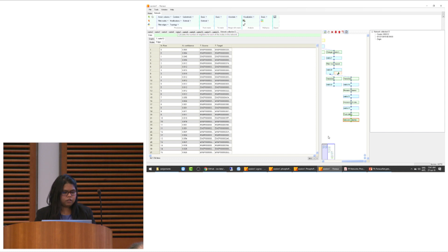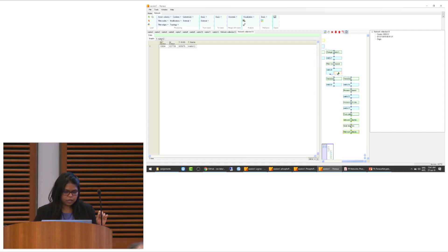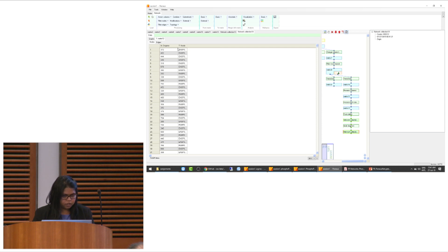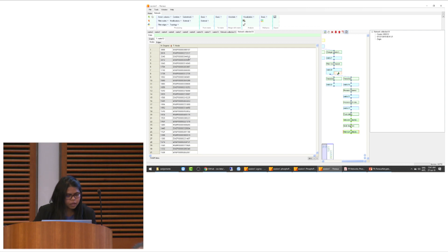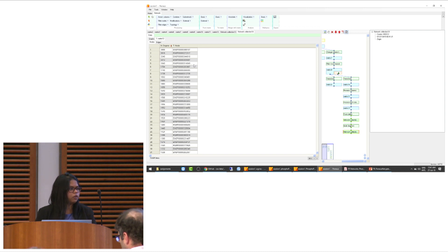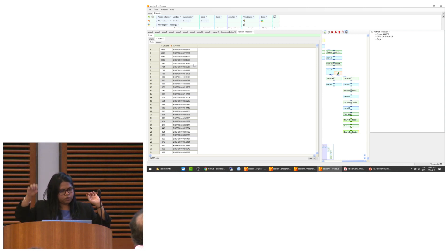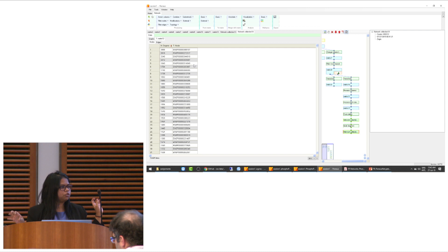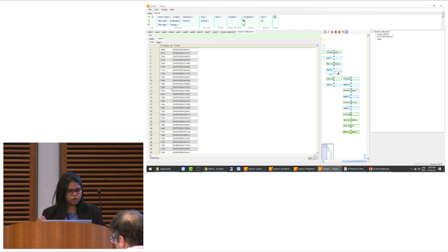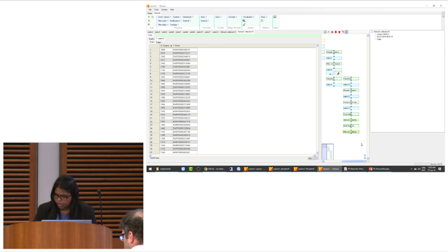Imagine the network as circles — nodes are the proteins and edges are the connections between them. The width of the edges will be defined by the confidence score. In the Graph tab, you can see how many nodes and edges you have. You can see that edges are more numerous because all proteins are connected to many other proteins.